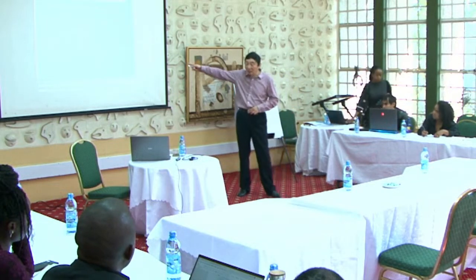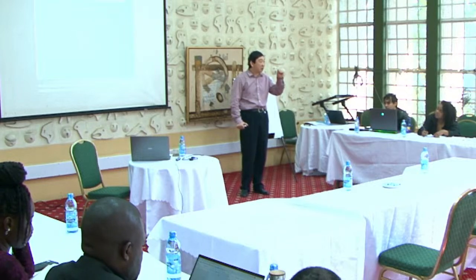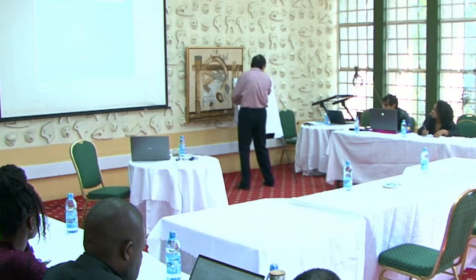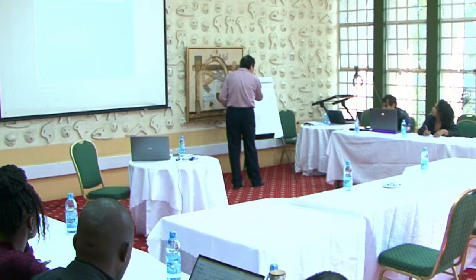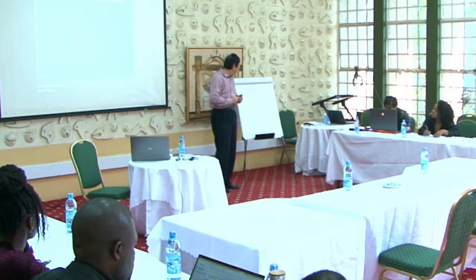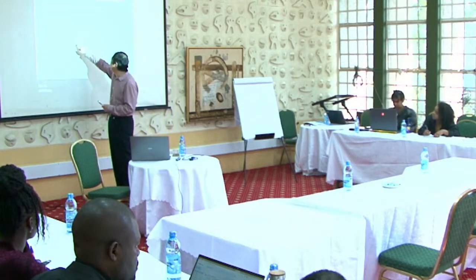So this does not look very strong. Not feasible, we say not so common. Most of the time you do not see it. Occasionally you see a weak one, right? Here it is strong, so we have a hydroxy. So basically you want to have a hydroxy here, added in some place. Here you may have a side chain, you may not have a side chain. For this part, you may have a substitution in place.